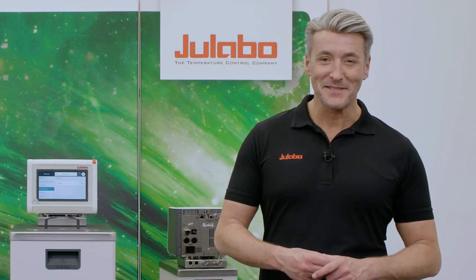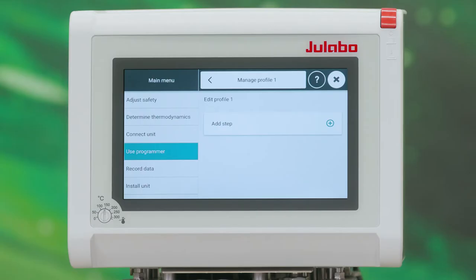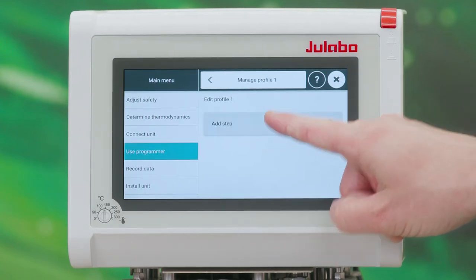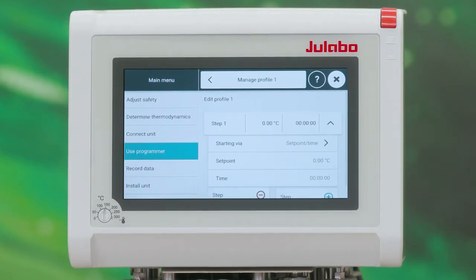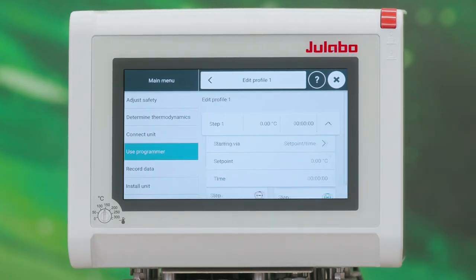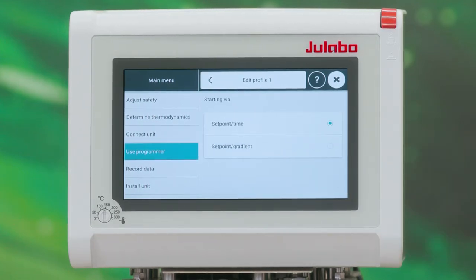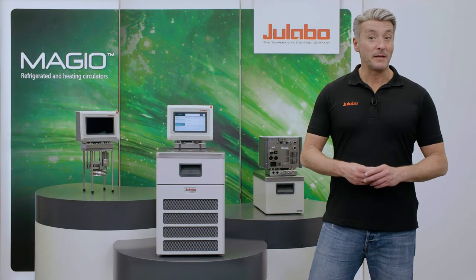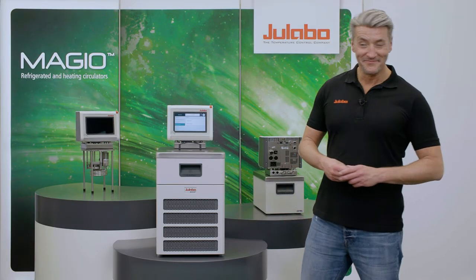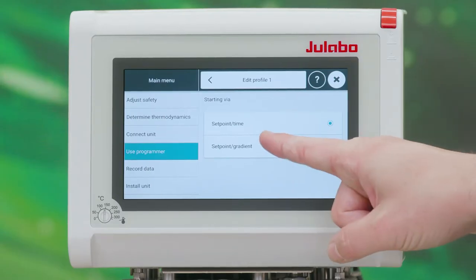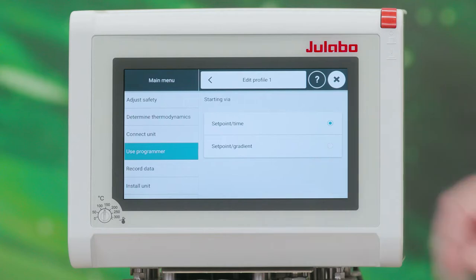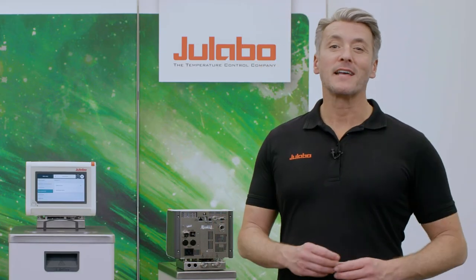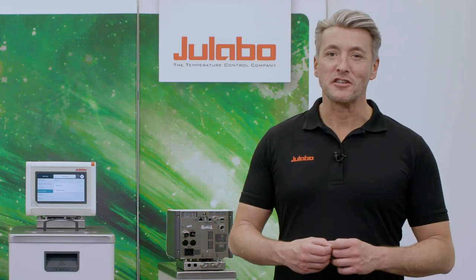Each profile can contain up to 60 individual steps. We choose Add Step. The step will be started via Setpoint Time, which defines a certain period of time in which the temperature is maintained, or Setpoint Gradient, which defines how quickly the temperature should be adjusted by degree per minute.